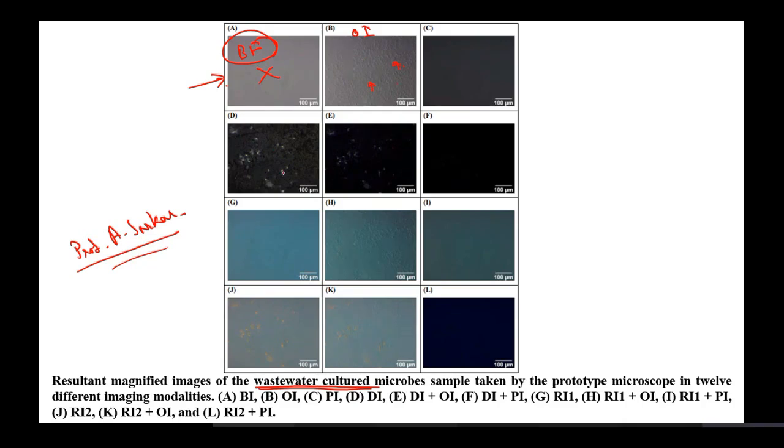Okay. Now again, in the dark field illumination, we have been able to extract some information. Now in this case, where we have Rheinberg illumination plus oblique illumination, we are getting a blue background, which is for the inner blue color which we have used. However, we are getting some 3D information.